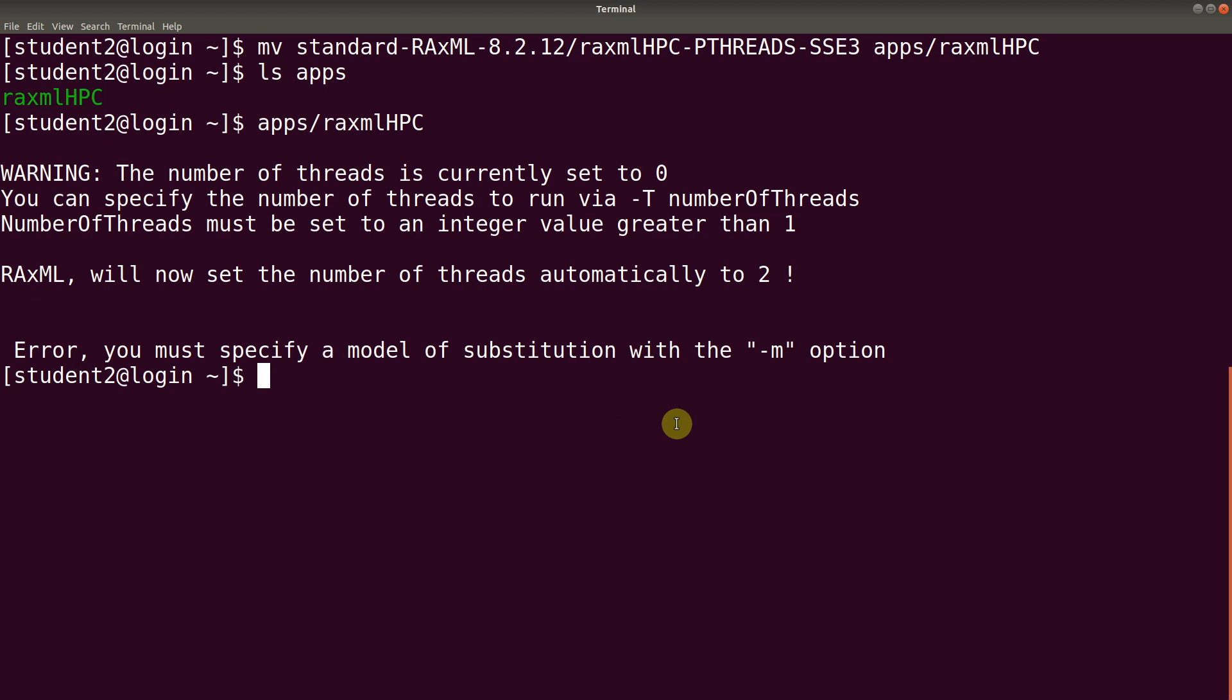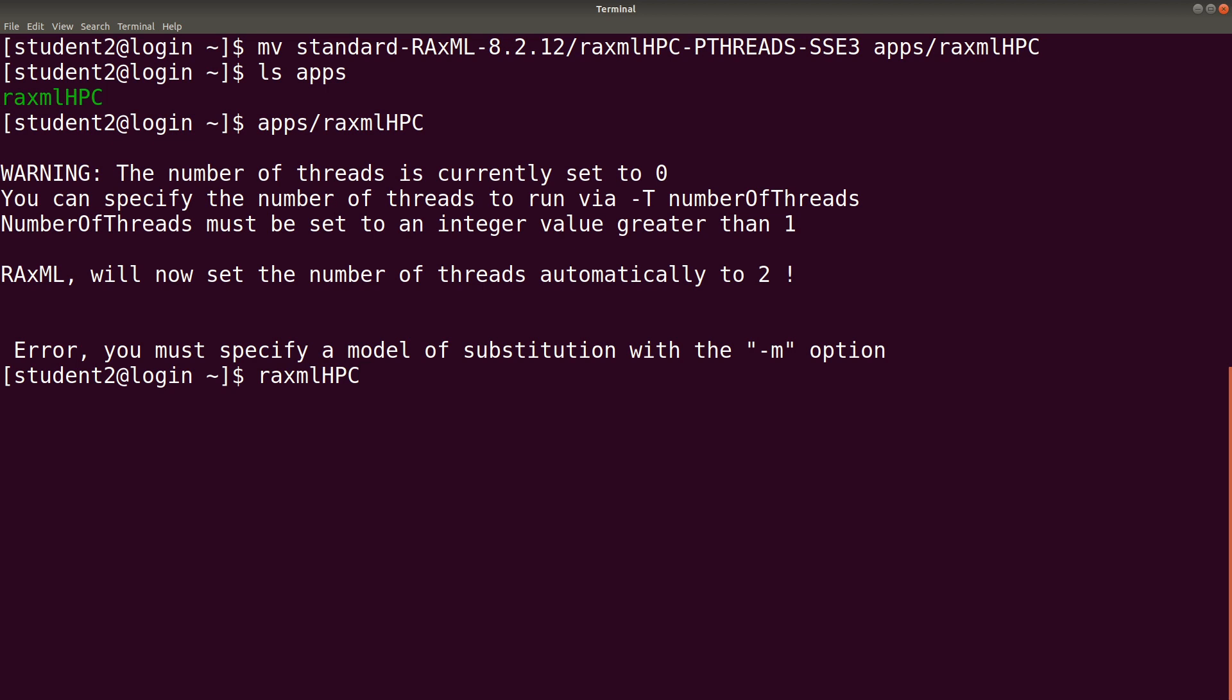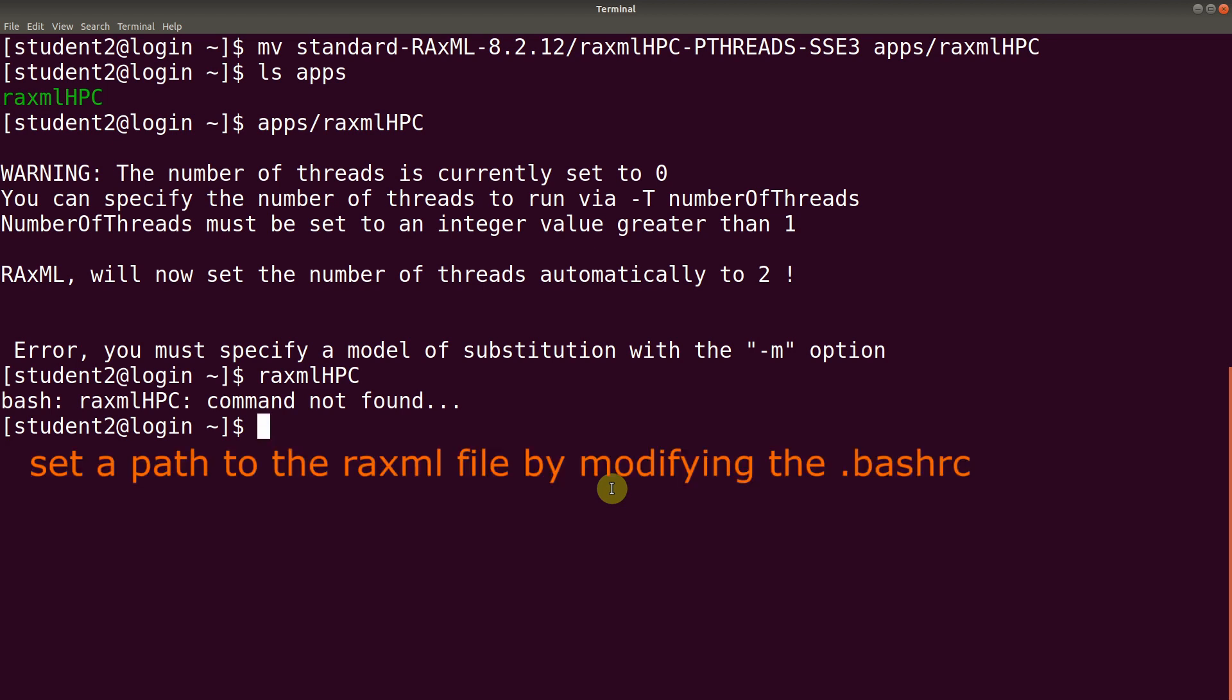With the current setup, whenever we want to run raxml, we need to always give the full path. This becomes problematic if we are in a different directory. We always have to specify that. To make it simpler, we want to make it in such a way that when we call raxmlHPC, it will be able to run. But with the current setup, when we type raxmlHPC, we will have this issue occurring. To avoid this issue from occurring, we need to set the path.